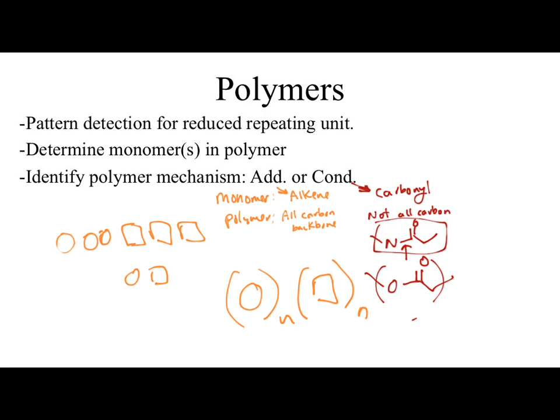The other things that you could see from the addition polymerization reaction is what physical characteristics did you notice for that one? Well, it ended up being a very solid, chunky thing. Okay, so it stuck to the slide and very, very hard. Okay, why was it very, very hard? It's not just the carbon backbone. It was the cross-linking in that polymer. There was a cross-linking unit that allowed that polymer to form a very hard, rigid substrate. Okay. When it came to the nylon, you didn't have cross-linking, so you had a softer polymer.